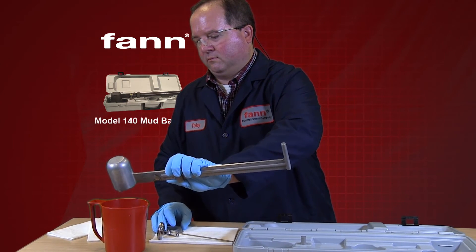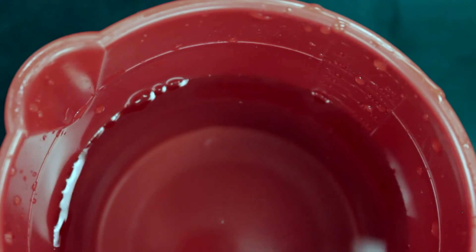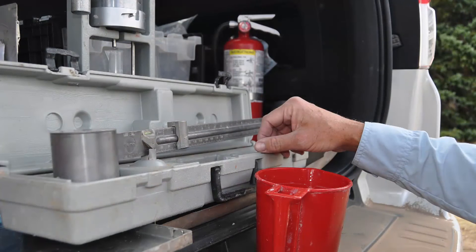The mud balance calibration should be checked frequently using fresh water. At 70 degrees Fahrenheit or 21 degrees Celsius, fresh water should give a reading of 1.0 on the specific gravity scale, 8.34 on the pounds per gallon scale, and 62.3 on the pounds per cubic foot scale. This spot on the balance arm is marked with a longer scale division line called the water line. Small amounts of mud on the balance arm or rider can cause improper readings.